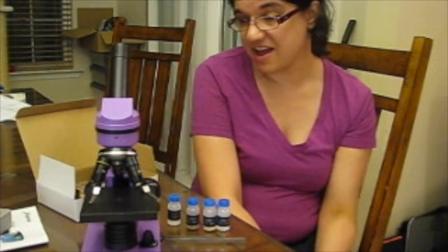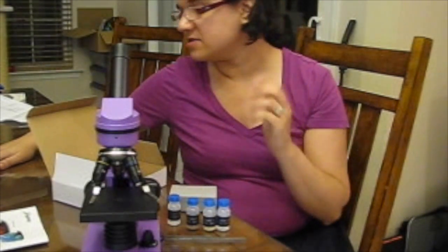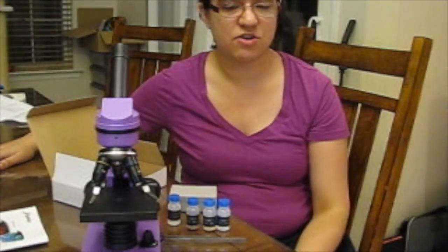And having all of the experiment kit stuff really makes this kind of a full package that it's not just the microscope. So yeah, really pleased with this Levenhuk product. Definitely one that I would recommend for other families.